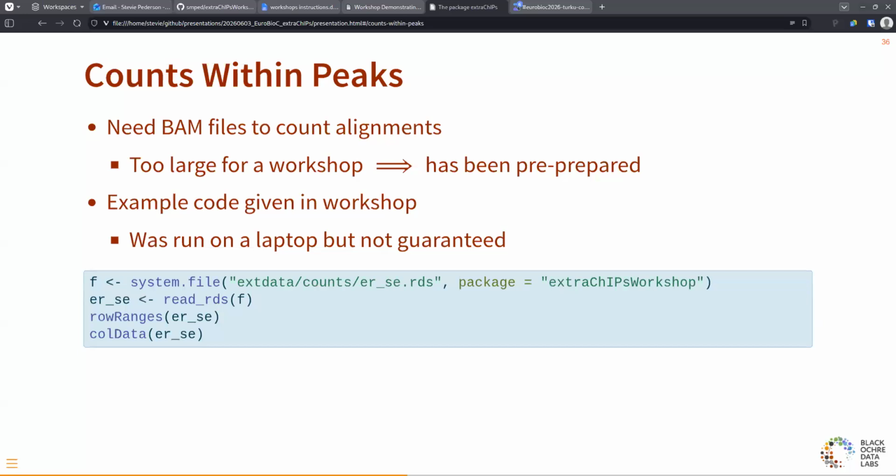And so it's a very different kind of data structure. We'll talk about that a little bit more in the normalization steps coming. And that makes what you choose for your library size makes a really, really big difference. If you choose the peaks to normalize to where there's no binding, the peaks where you've got binding will look like they are the strongest peaks in the history of the universe. And so it's really important to use the complete library sizes, not what you find within the peaks, unless you're really confident that they're the same distributions. Generally, people don't.